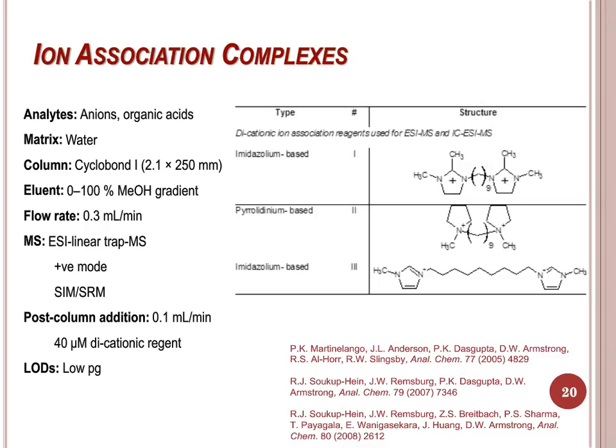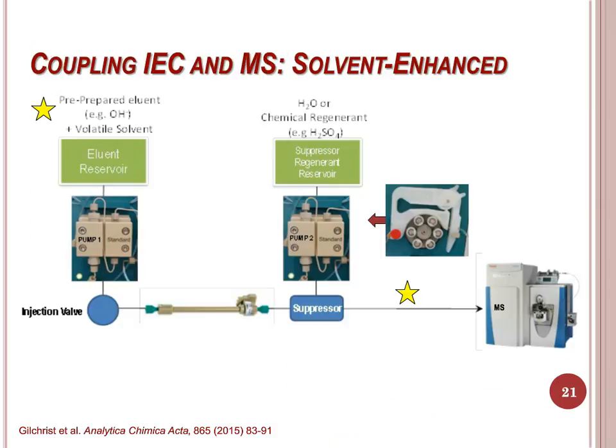An alternative method is to include organic solvent for ESI in the eluent pre-separation. This allows you to cut out the tertiary pump and T-piece. However, the presence of organic solvents in the eluent may cause some changes in packing bed volume, which may lead to effects on retention, separation selectivity, and efficiency of the analytes, as well as system back pressure.